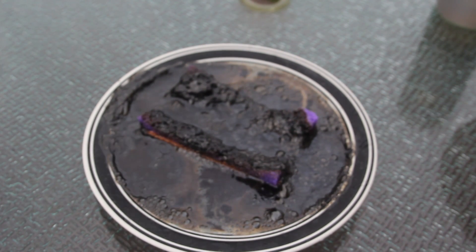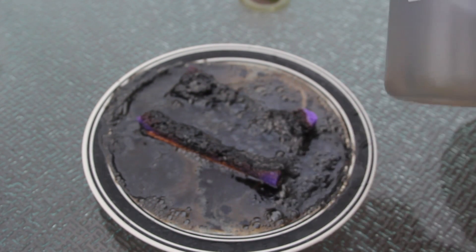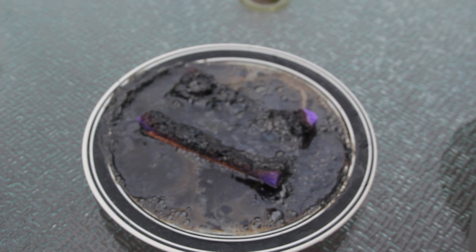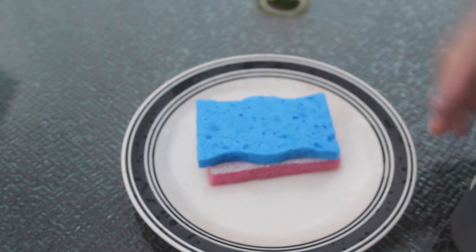And of course I gotta be careful not to touch it, because it will burn my hand. It's not hot at all, but why is it burning through the sponges? Let me know in the comments below how it works scientifically. Let's try this one more time just to see how crazy it was.